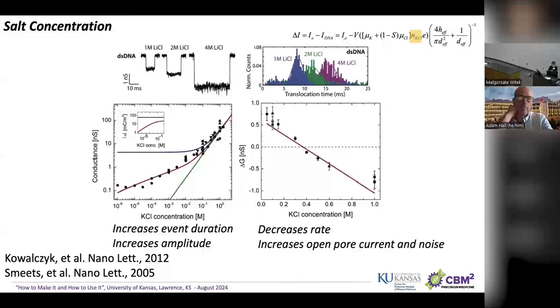So the question is, instead of single-stranded DNA, what if we have a single nucleotide, or something very small, that has only a minus one charge? Can those nucleotides, for example, attract more than one counter ion? So basically, does this trend, those three signal-to-noise ratios that you showed, will they be similar when we translocate a single nucleotide?